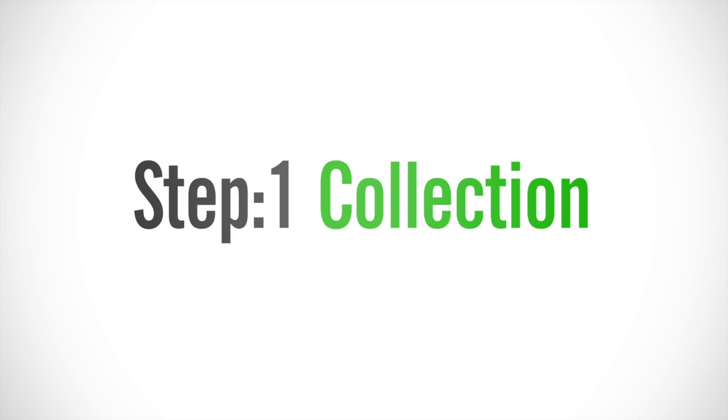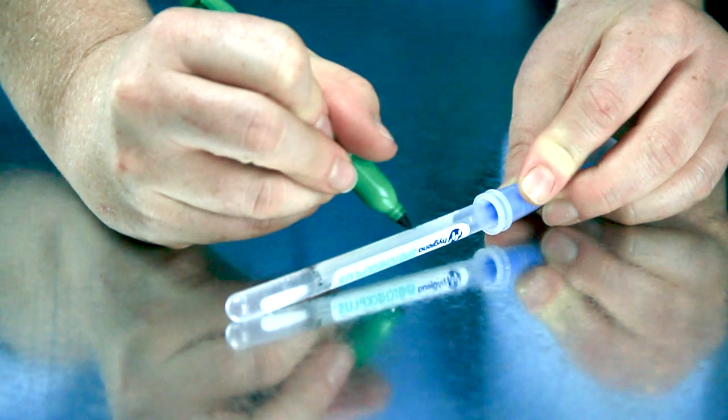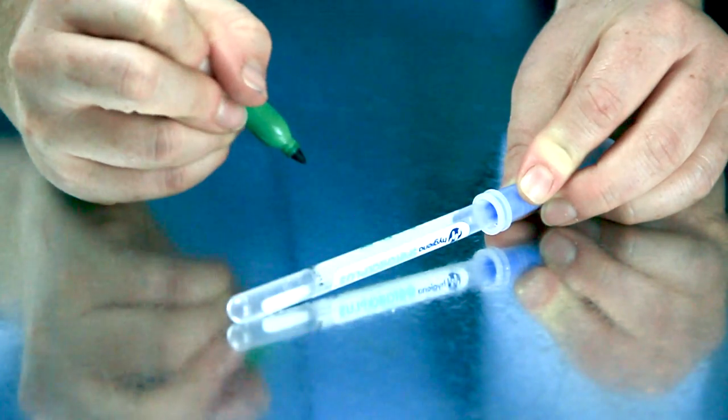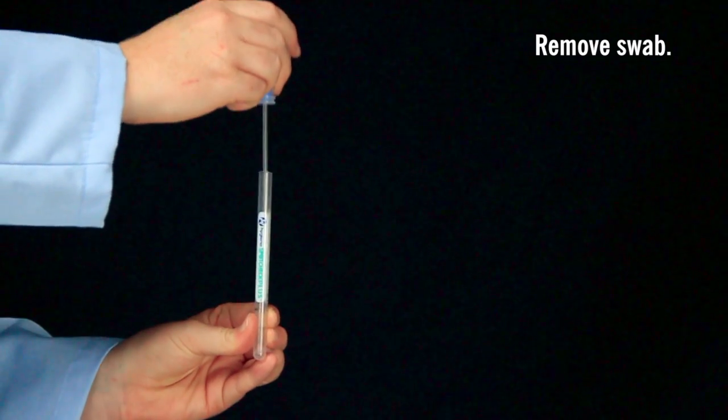SpotCheck Plus is a two-step test. The first step is collection. Write the test location on the label for easy identification. Remove the swab from the tube.